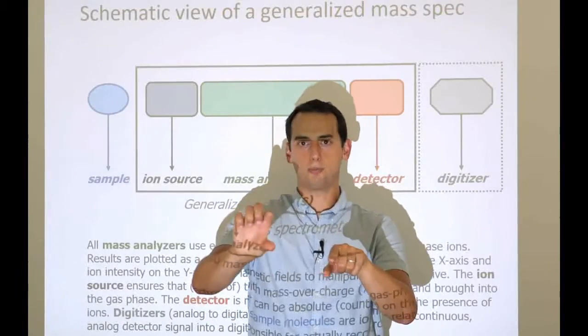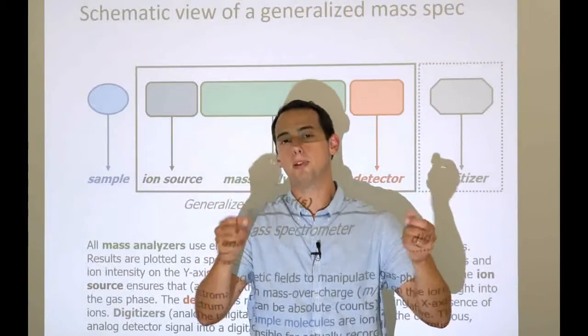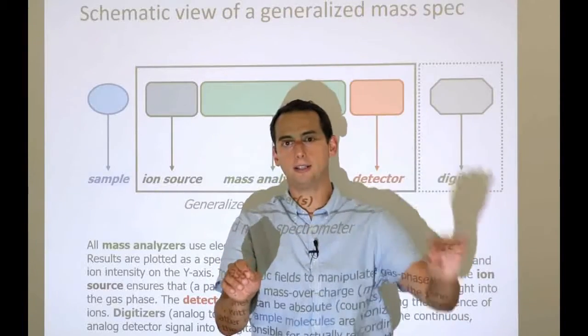It's going to measure a small amount, a large amount, and then a small amount again. And then the problem is, for this beautiful curve, we only have 3 points. So the closest approximation that we can do is just make a triangle out of this.